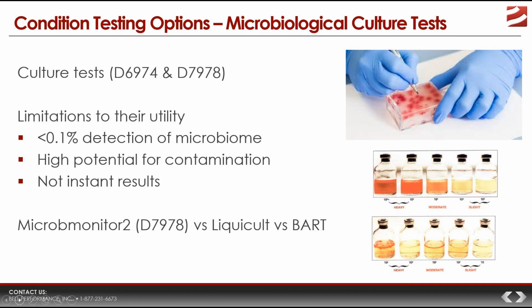Recognizing the differences between these three options should illustrate an important point about how different kinds of tests only give us differing fractions of the picture. Some tests are better at this than others, but any test is only going to give us a sampling of the true situation. What we want to do is select a test that gives us the best fraction of that.